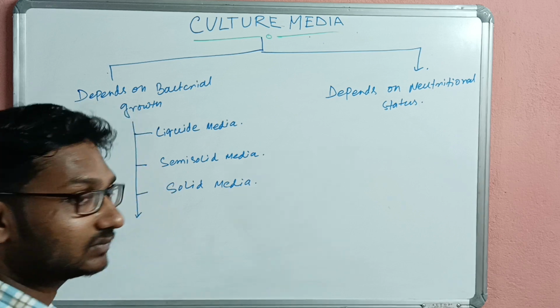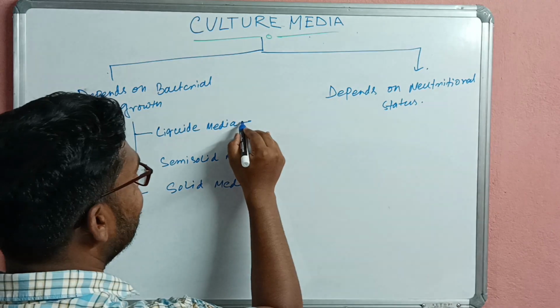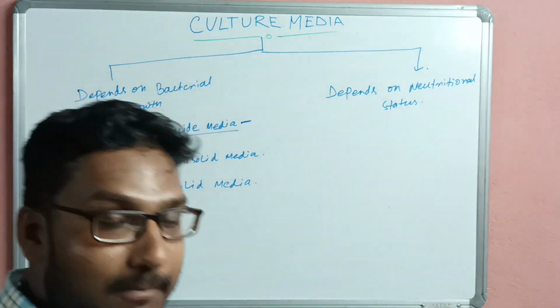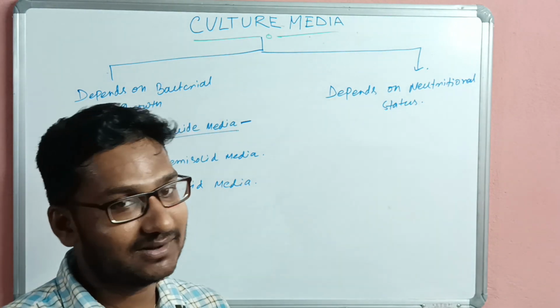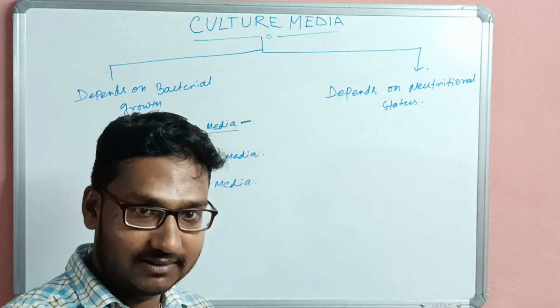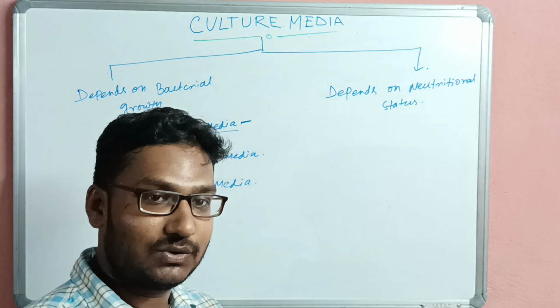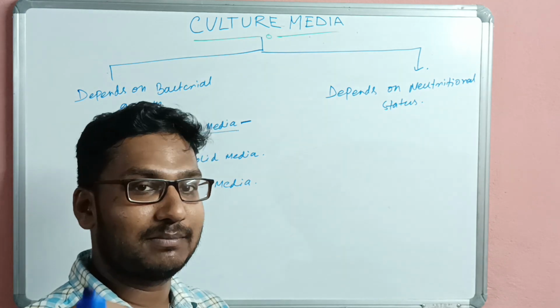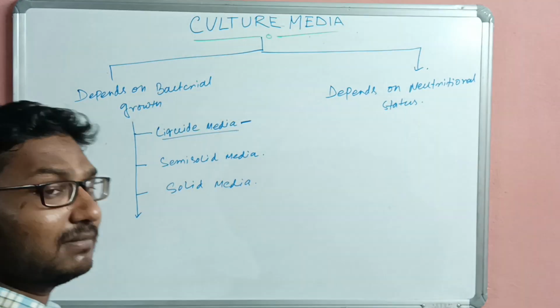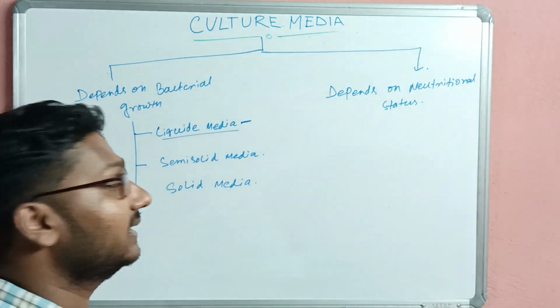Liquid media is generally prepared by mixing with water or any chemical compound, and it has some nutritive property. Liquid means water must be present. What is the disadvantage of liquid media?